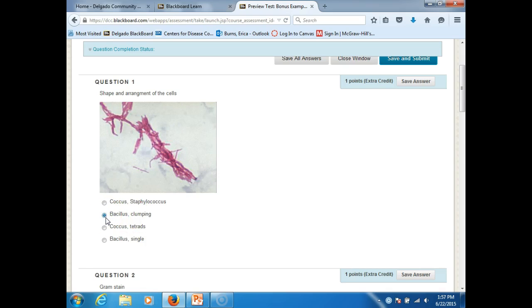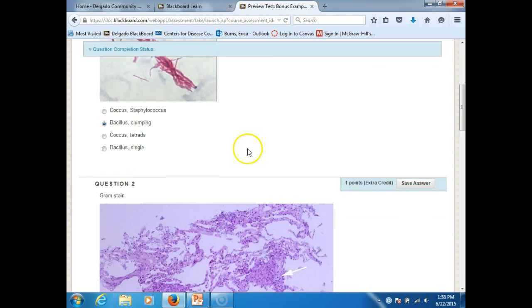This is very common for acid-fast bacilli, AFBs, not acid-fast bacteria. Hope you didn't miss that on the quiz today, right? If you had your homework in front of you, you shouldn't have missed it, right? So it's a common abbreviation for these guys, and they tend to clump together.